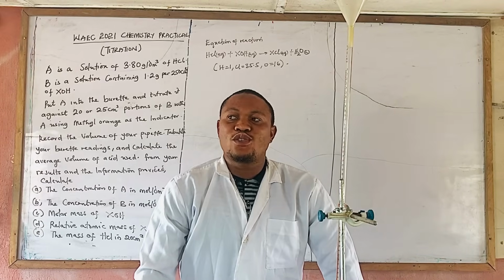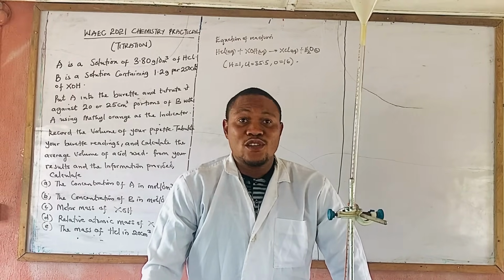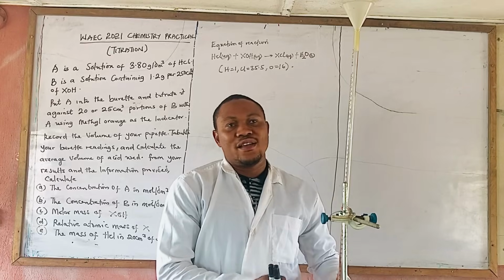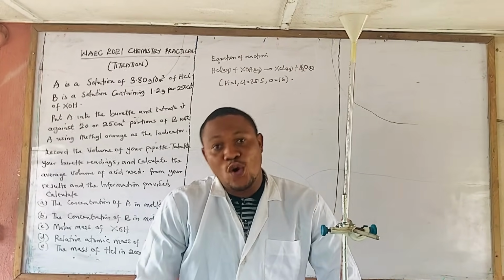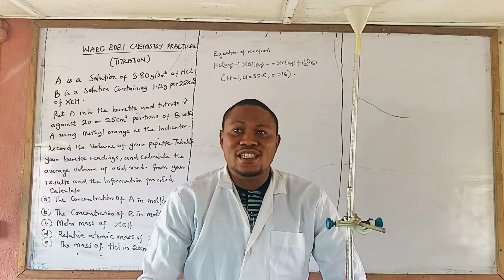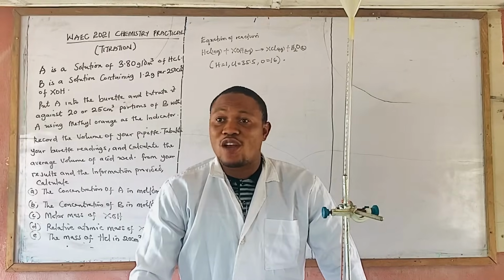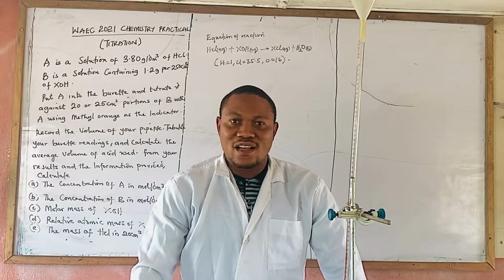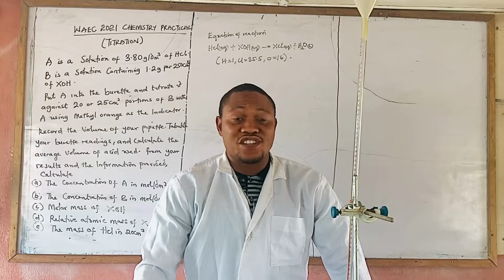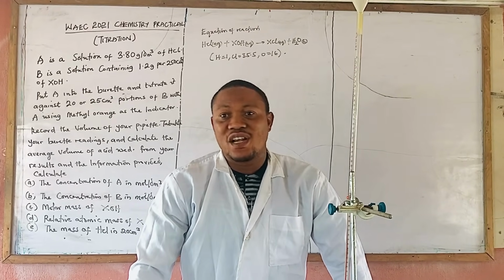So please, I want you to pay attention to the teachings I'll be doing today so that you can be kept abreast of what the question is going to look like. Please, I want you to pay maximum attention because this will actually help you to come out in flying colors in the ongoing WAEC. So today we'll be taking the titration, which is the number one question, which we refer to as the volumetric analysis.